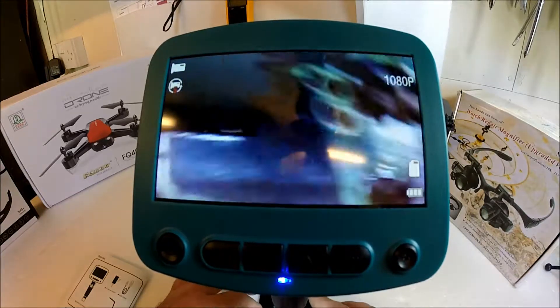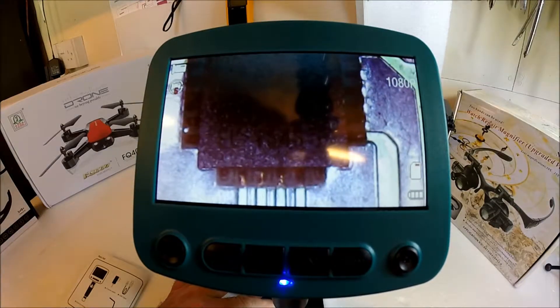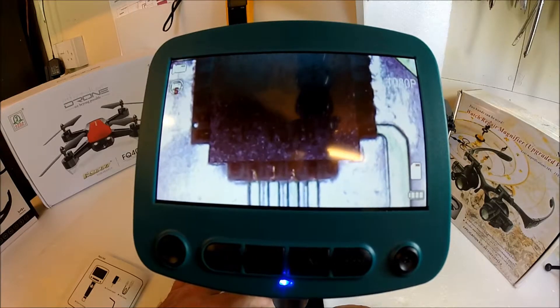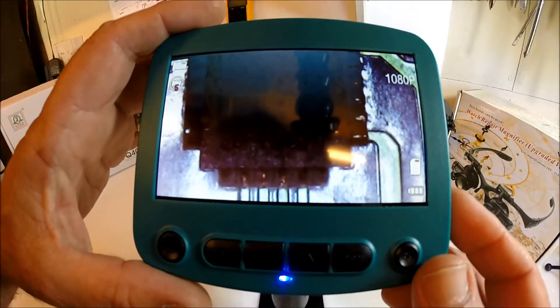It may be upside down, so let's just move that around. I couldn't see that with my eyes — even with glasses I would probably have a problem. So let's adjust the light and see if we can make this a bit better.